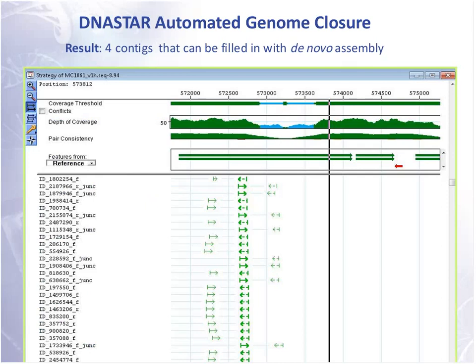We use the pair data with our Illumina data, the pairs that anchor in the unique area in the contig and the pairs that fall into this insertion element. We generate a contig there and then merge them automatically. You can see these are labeled in a different way, a different code, so we know what type of sequences they are. That's what we're shooting for. We want to see that happen at all these structural variations.